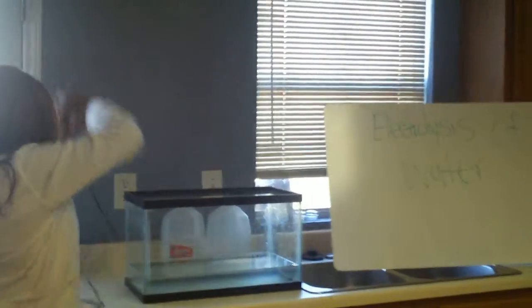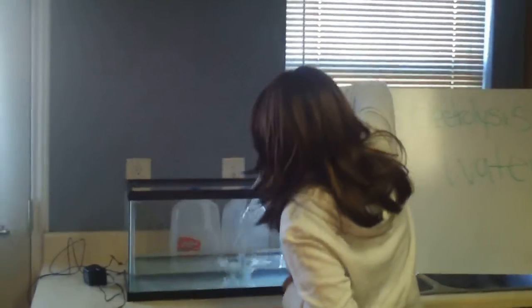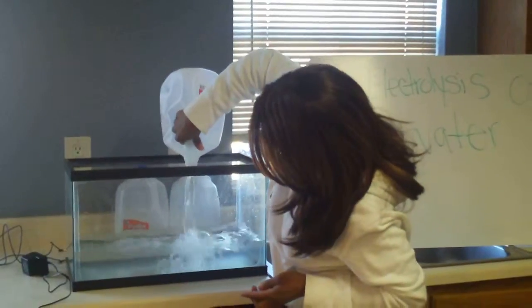Okay, to begin, you're going to need to pour your distilled water into your fish tank.